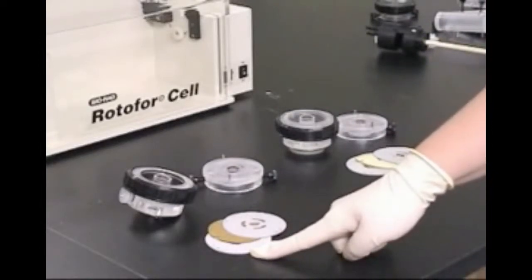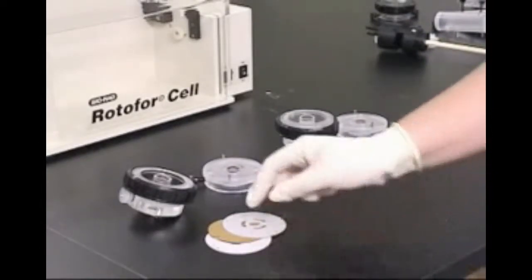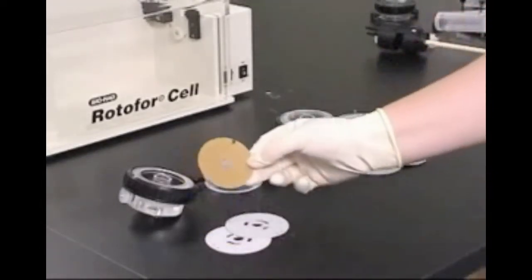The inner and outer components contain between them a sandwich consisting of two gray silicone gaskets and one ion exchange membrane.